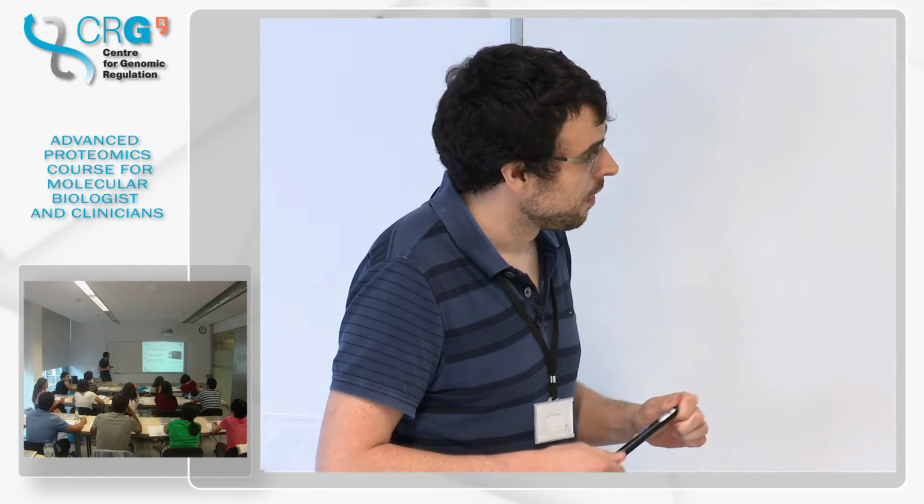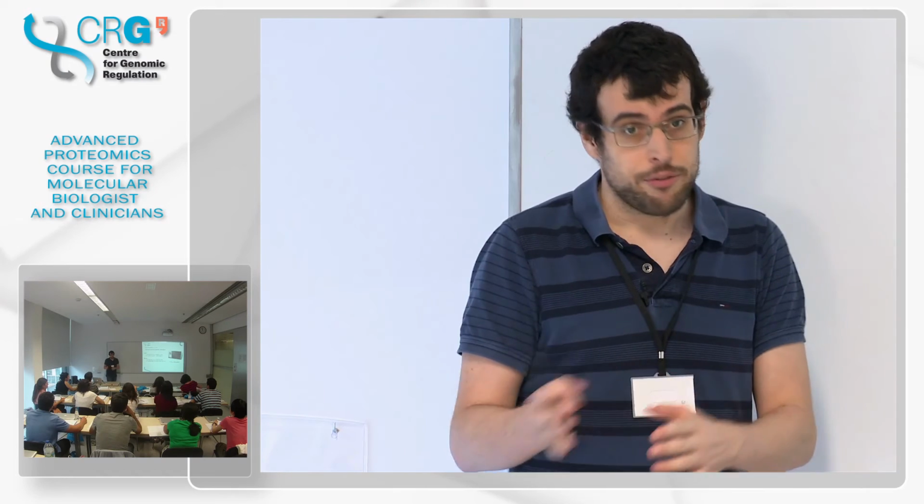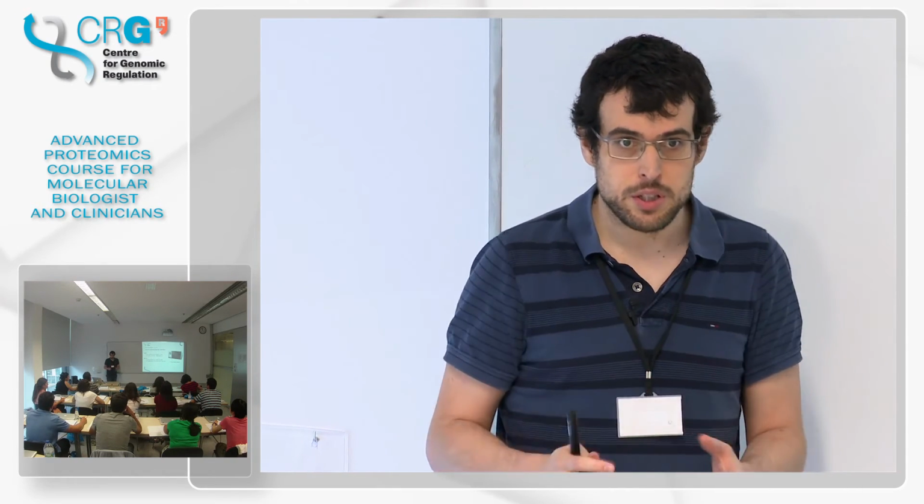So questions? Would you say fractionation is online fractionation with your HPLC, or? So this can be online fractionation or offline fractionation, like size exclusion or a gel, and we cut several pieces, whatever.